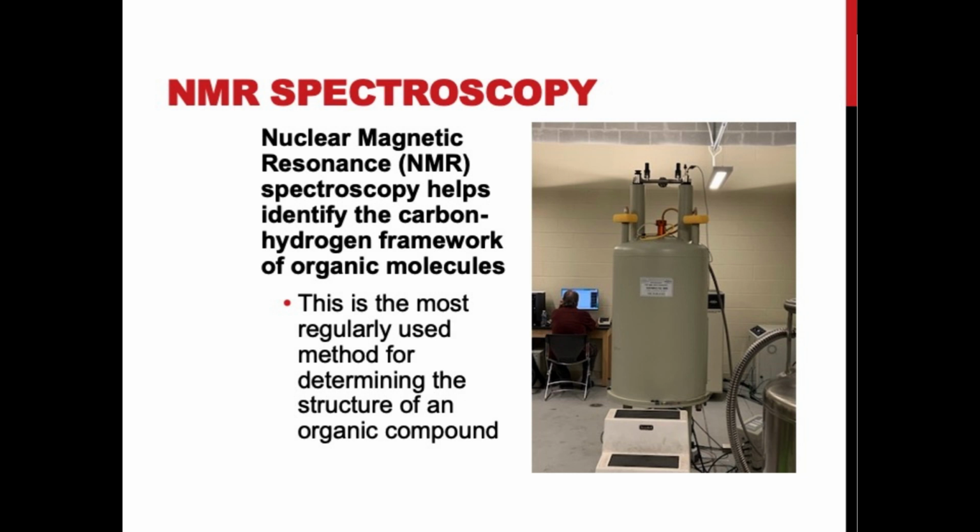All right, so we're going to talk about NMR spectroscopy now. So throughout the semester, we've been doing reactions to make molecules on paper, but how do you know what you have made actually in the lab? And the way you know what you've made is spectroscopy, and most commonly, NMR spectroscopy.